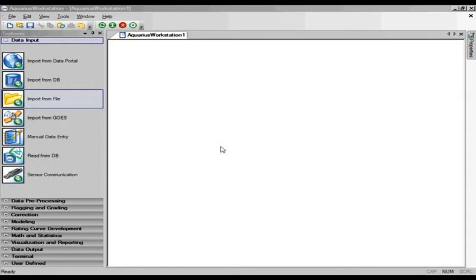In this video, we're going to discuss profiling data. Typically, when we're monitoring water quality, we have sensors deployed at fixed locations, and those fixed locations will record values over the course of time. So our data will come in time-tagged format or time series format. What we're going to do in this particular example is go through data that actually has both a time and a spatial or a depth component with it.